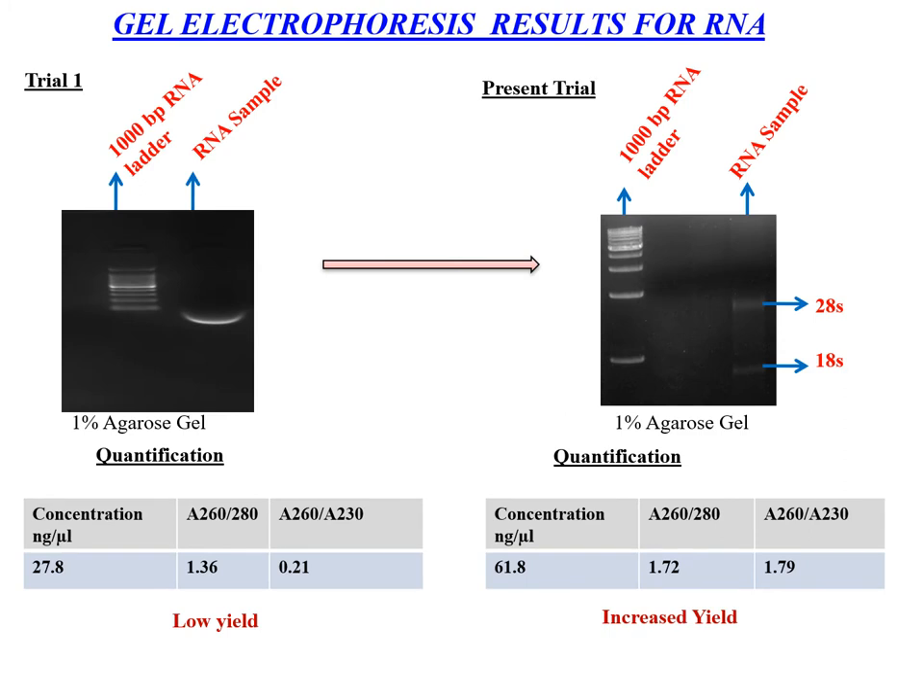These are the gel electrophoresis results for RNA. Initially, the bands were not clearly seen, the ladder was not clearly resolved, and both purity and yield were low. Later on, we see that the yield and purity have increased, along with clear bands being visible.